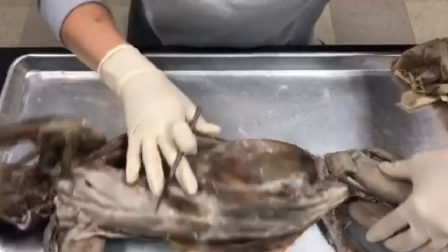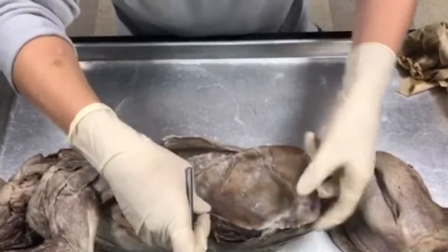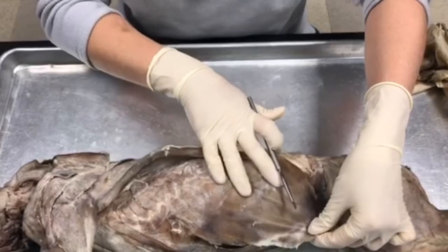Moving more towards this side, we have this outer layer here. This muscle is going to be known as your external oblique.